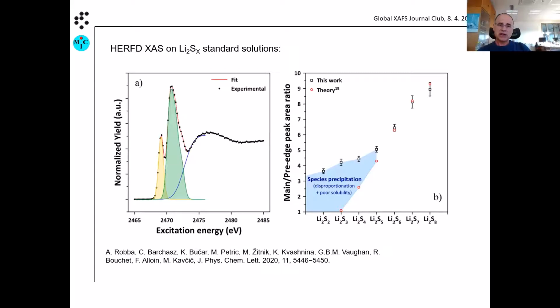I would say it's comparable. It's even more complicated with the RIXS because you have certain weights, because of course you excite resonantly. So there is not a direct relation between the intensity of your signal and the concentrations. So in this case, I would say even absorption is more straightforward.